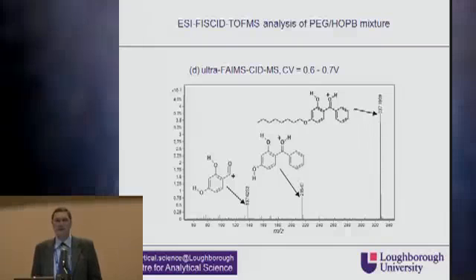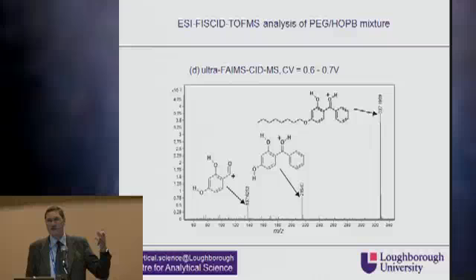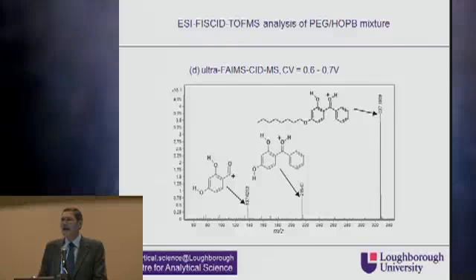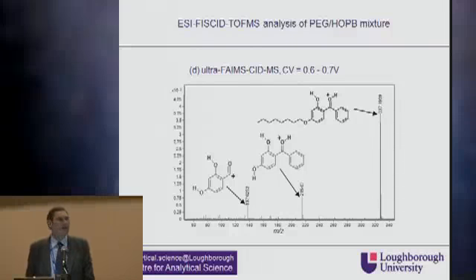As in tandem mass spectrometry, instead of having selection of mass-to-charge ratio, CID, and then mass-to-charge ratio selection, here we've got FAIMS, collision-induced dissociation, and mass-to-charge ratio. So an ion has to have the correct FAIMS transmission characteristic, and it has to produce fragments of the right mass-to-charge ratio in order to be detected, enhancing selectivity.